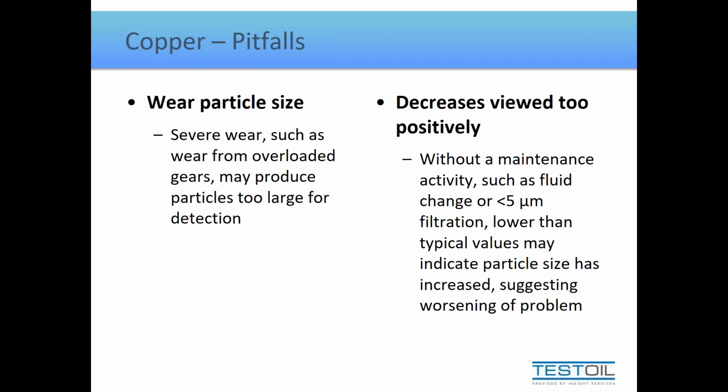So I always try and point out that if you're trending wear metals over time and the trending is slowly increasing, and then suddenly stabilizes, and then for the next bunch of samples doesn't increase, one might assume that the wear has stopped. I try and assume that the wear has actually progressed beyond normal wear into abnormal wear until I can prove otherwise.